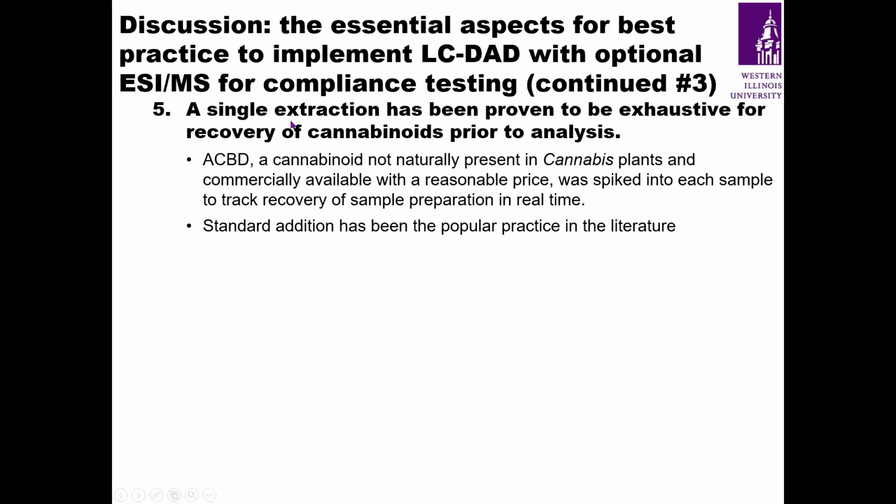Now, a single extraction has been proven to be exhaustive for recovery of cannabinoids prior to analysis.